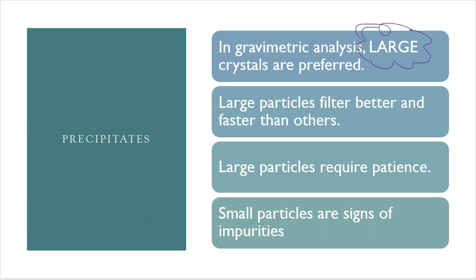And one of the reasons that this happens is that, number one, you rush it. You don't give it time to precipitate out. And number two, you have to let it come to room temperature. If you don't let it come to room temp before you sock an ice bath to it, then you typically are going to end up with smaller grains of crystals than before. So patience is a virtue yet again.